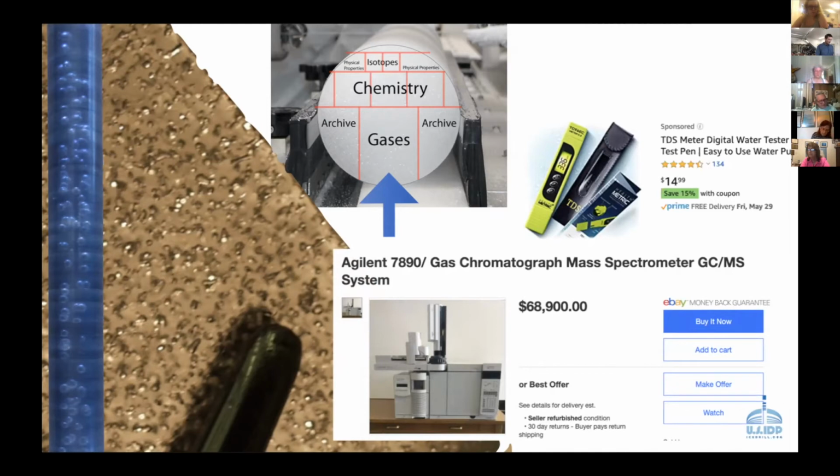So go ahead and turn your gauge on and make sure that it says microsiemens per centimeter. So click on shift. Yeah, if you're on the wrong units, you can hit shift and it should go to microsiemens per centimeter, and then you're ready to go. And now you're ready to measure conductivity.